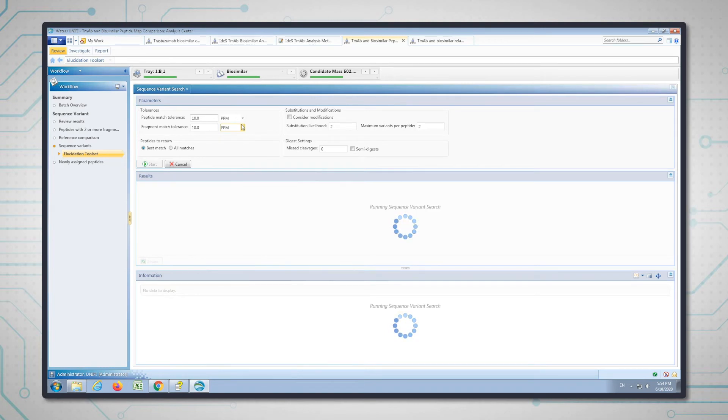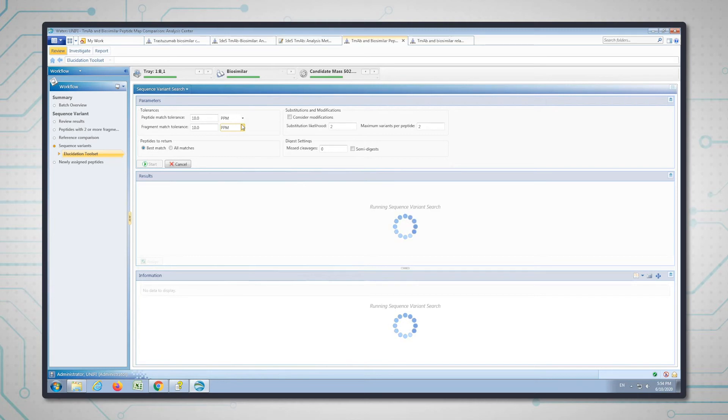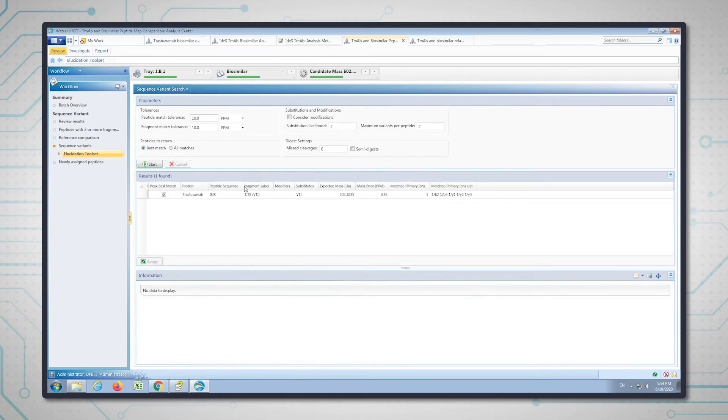The software is doing quite a lot now. It's taking that big list of in silico tryptic peptides and creating different amino acid substitutions in each peptide to see if it can match. This substitution likelihood is based on this matrix—it's going to look for the most probable amino acid substitutions. It's come up with a possibility here.